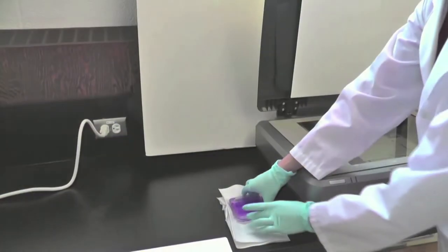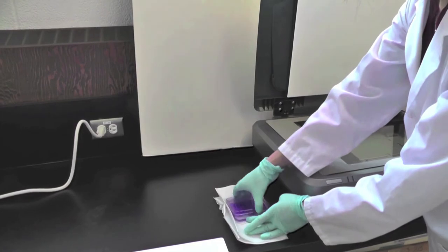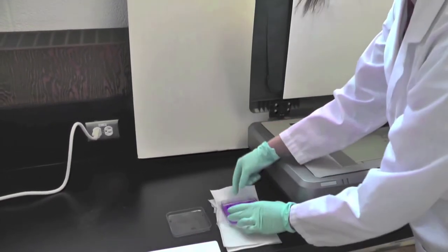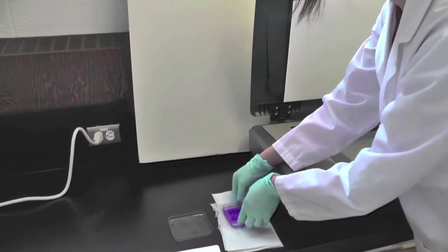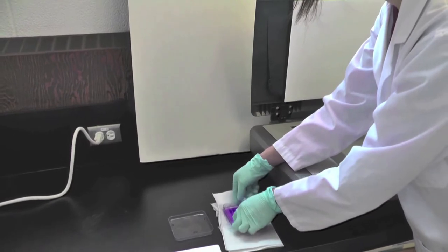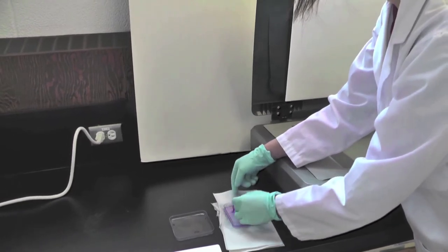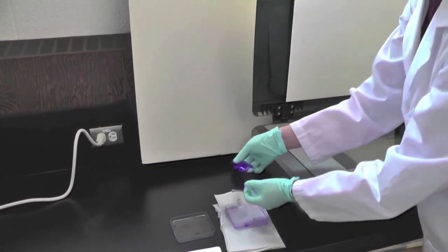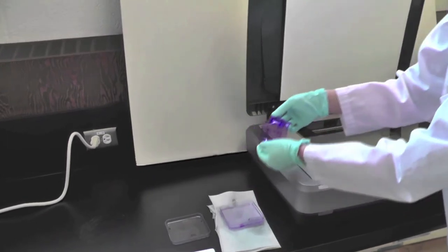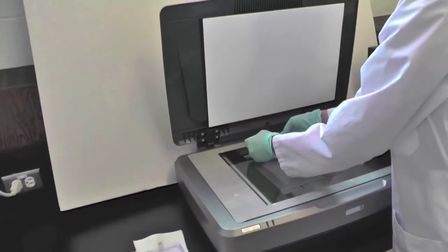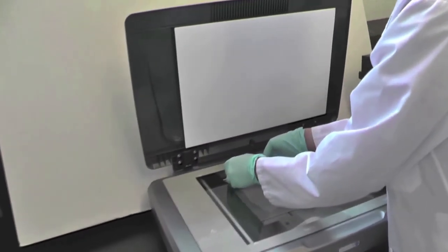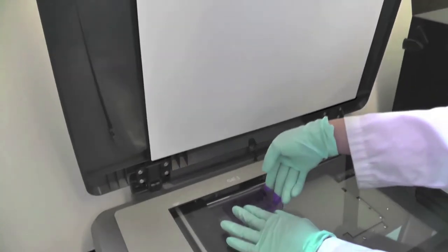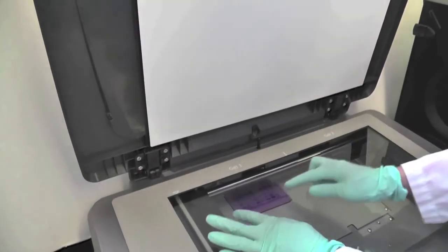When handling the gel, make sure to wear gloves to prevent your hands from getting stained. Gently remove the gel from the petri dish and place it down onto the scanner. Avoid trapping in air bubbles when doing this.